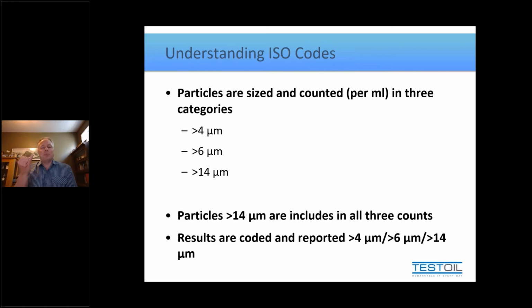Look at the tip of your pinky. It's about the volume of the pinky from the last knuckle. It's not very much fluid. It's a very, very small volume of fluid, and we are counting hundreds, if not thousands, maybe even 100,000 particles in that volume of fluid. And that leads people to wonder, well, is it a lot or is it a little?